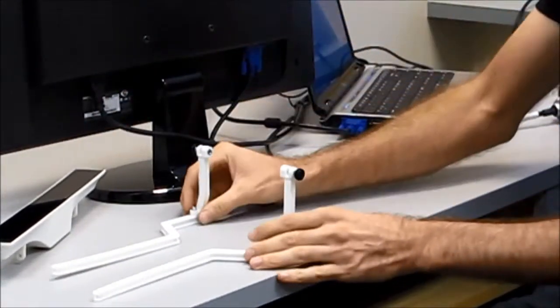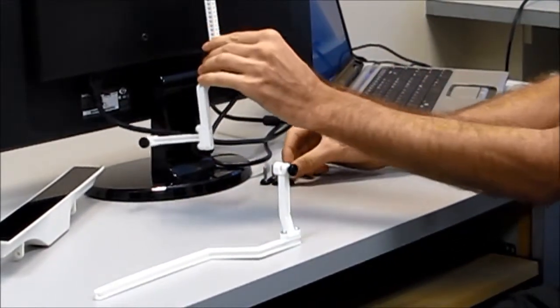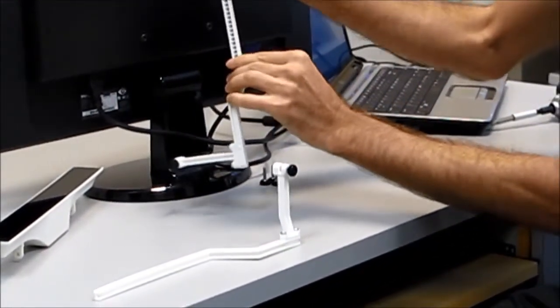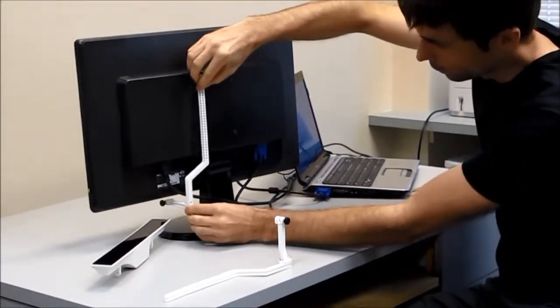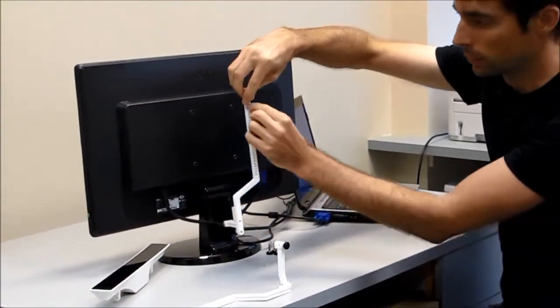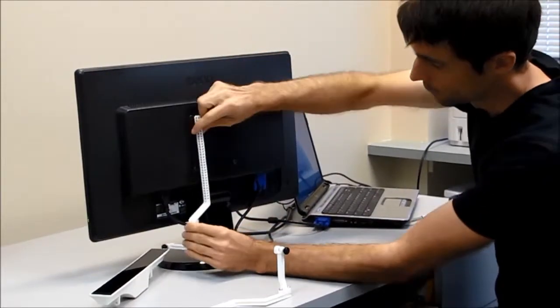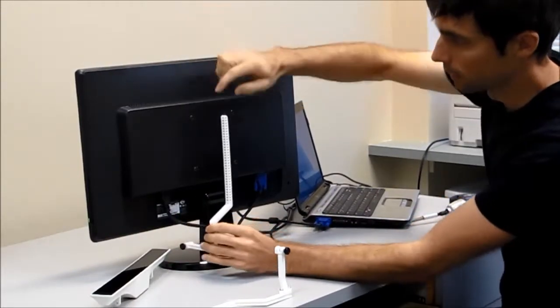To mount it to the display you just take one of these thumb screws and drop it through. You might have to try a couple of different hole spacings, that's why we have so many different spacings here. That lets you adjust it up and down depending on the size of your display.